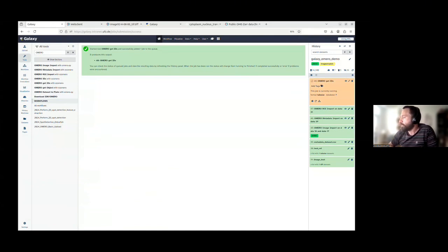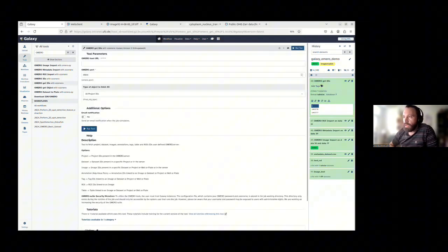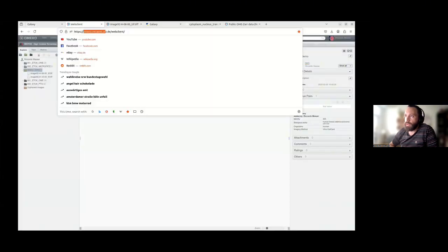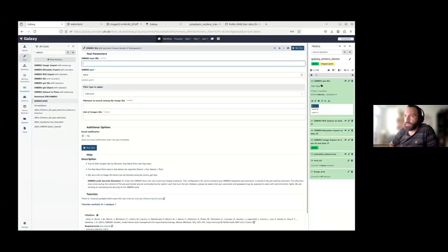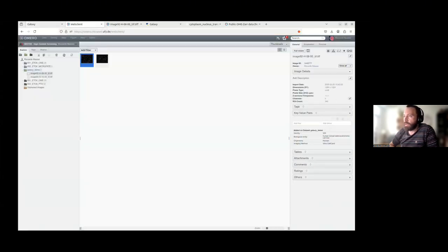It takes a bit of time. And here we have the two IDs of the images that are inside. If I want to go more fine-grained, again, I need to put the Omero URL. This can be automated in a later step. For example, I want to search by key value. For this image, I will add some metadata, some key value.